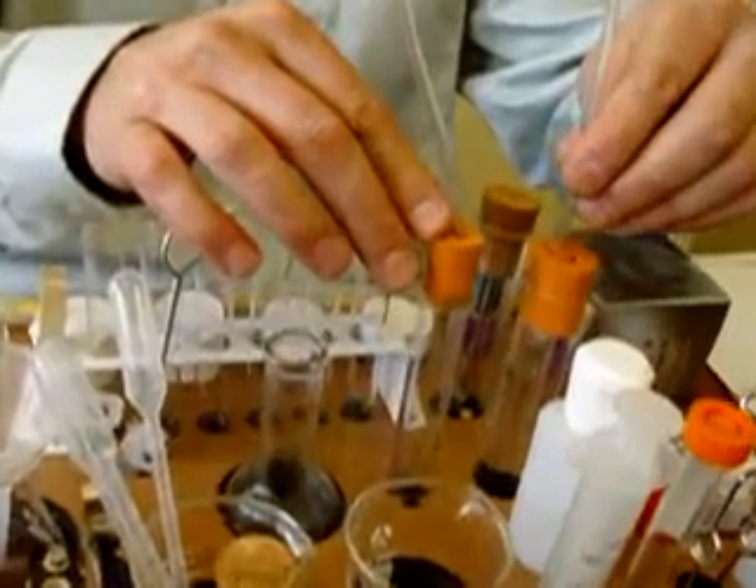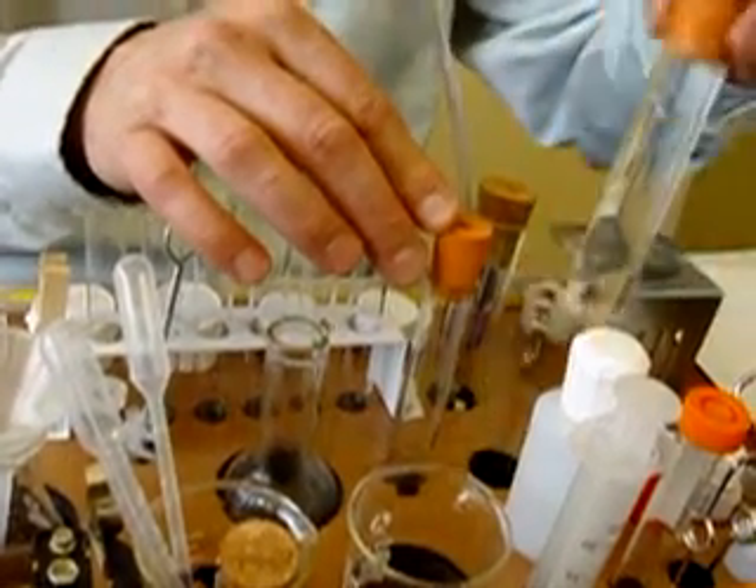The other end of the delivery tube I'm going to put into the smaller hole of the bigger test tube, which has been filled to the brim with water.